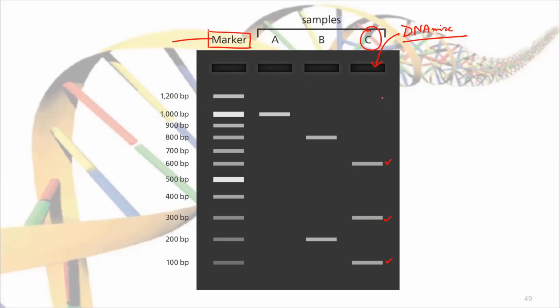Now let us say this is the marker. Marker contains, it is a mixture of multiple DNA fragments, very important, of known molecular size.